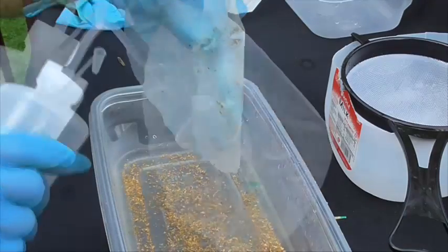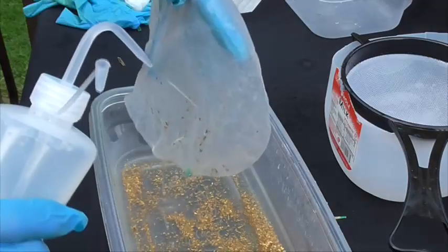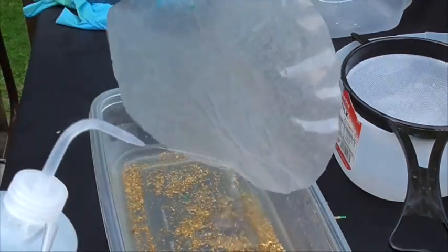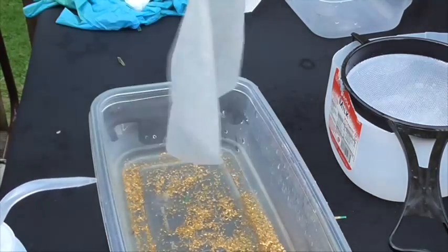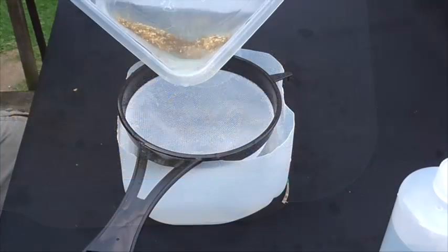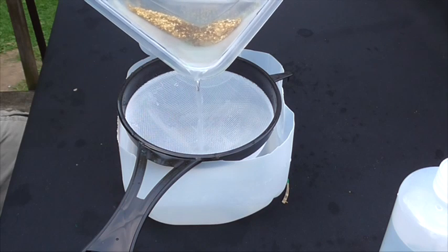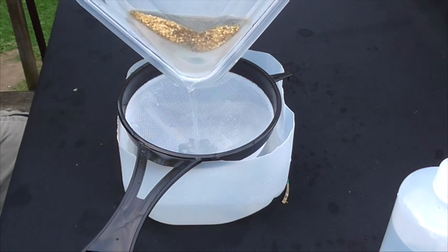Now we're going to clean the filter. Be sure to get all the gold off this filter. Now look at that. Now we're going to get the water — we're going to rinse that out and try to get as much water out as possible before we put it into our beaker.